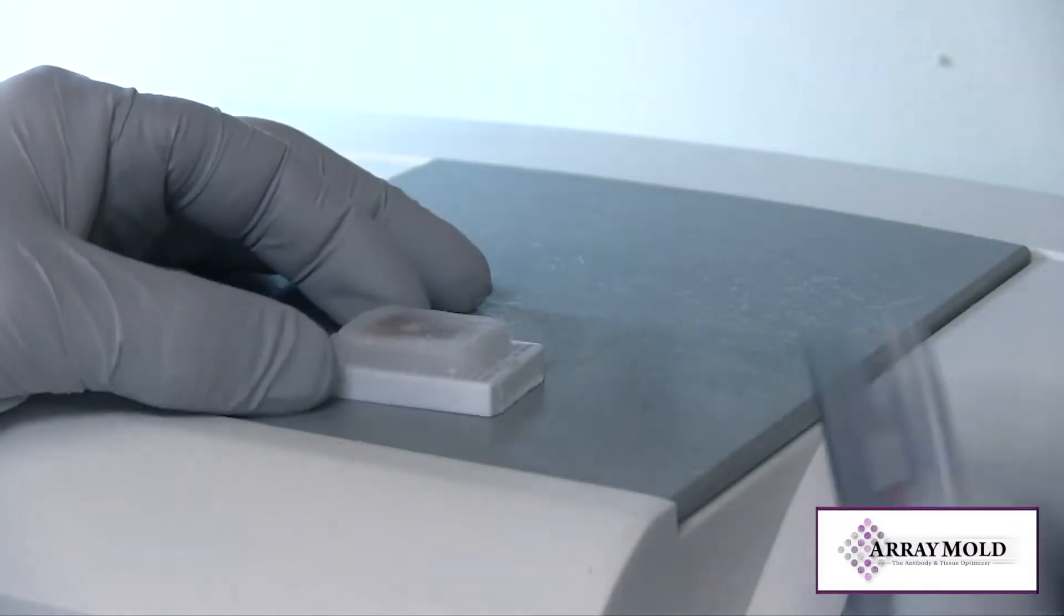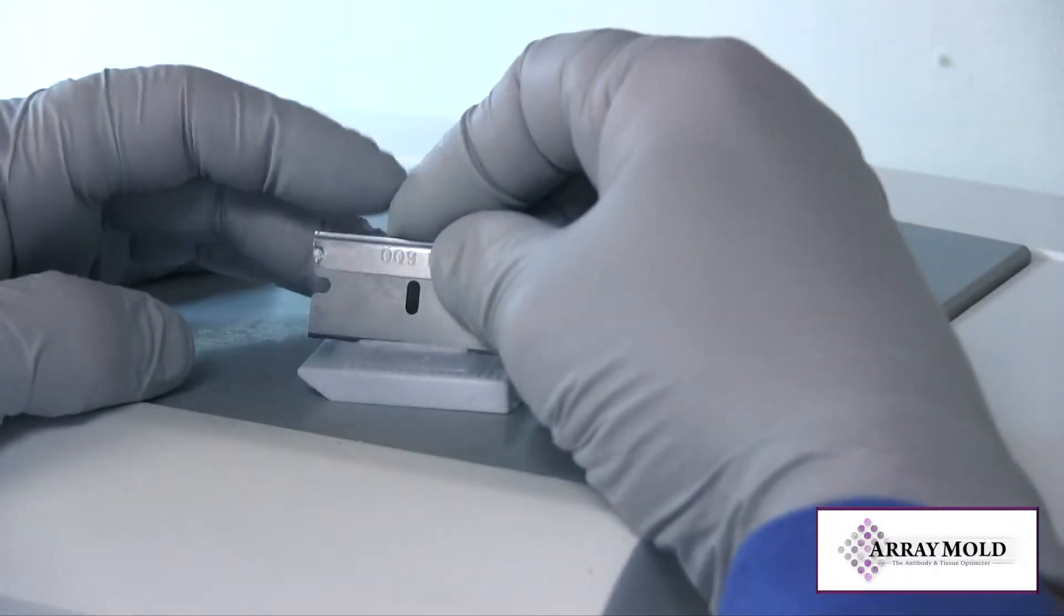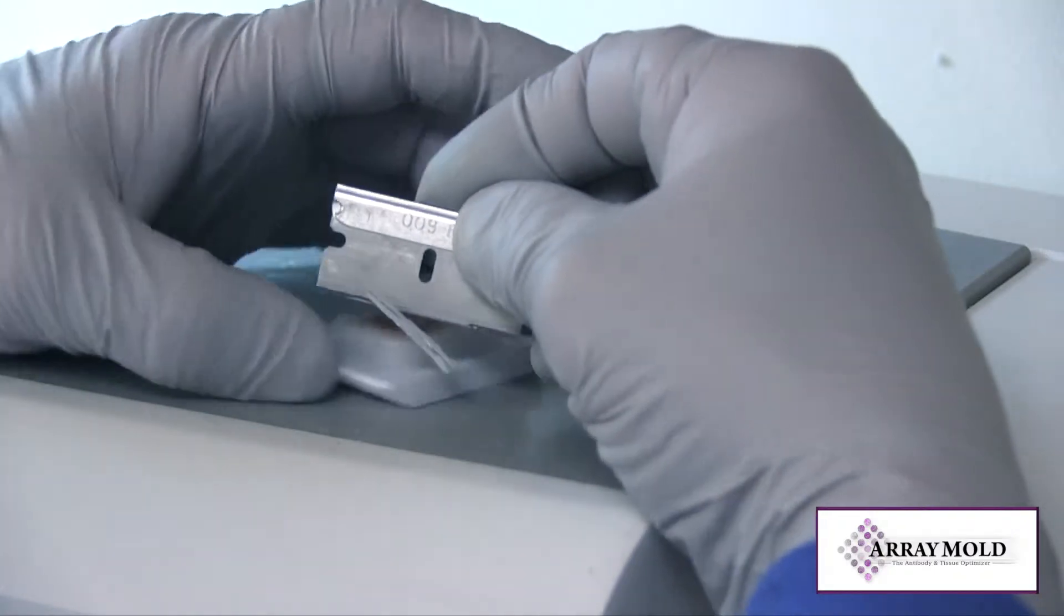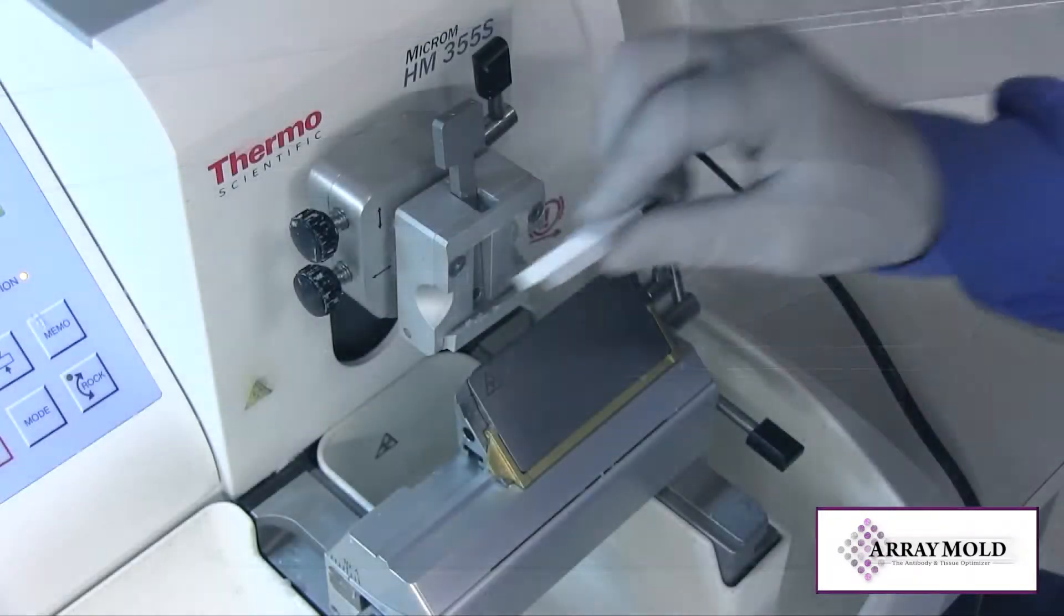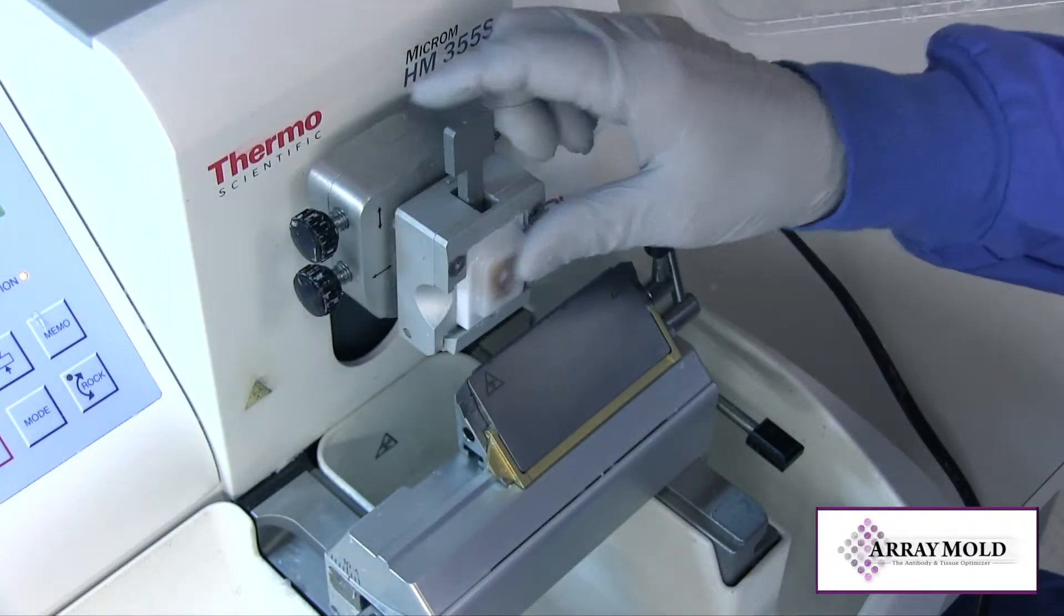Prep the block by trimming away the sides so the block can ribbon easily when sectioning. You will need to trim into the block a little bit because the surface is coated in paraffin.